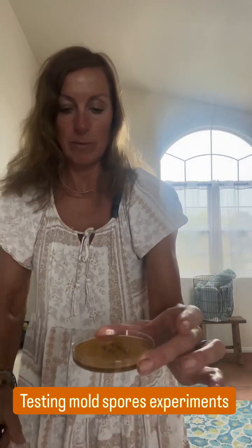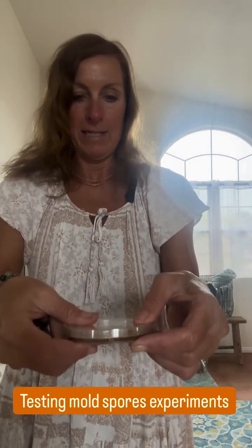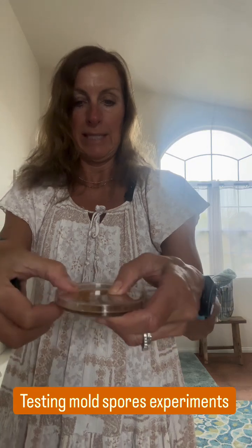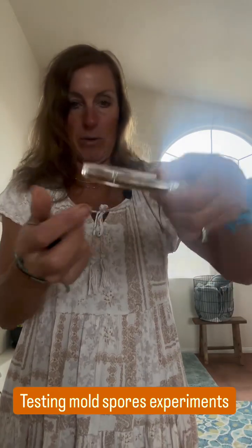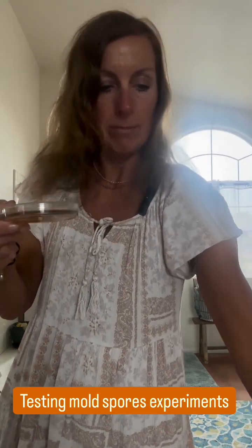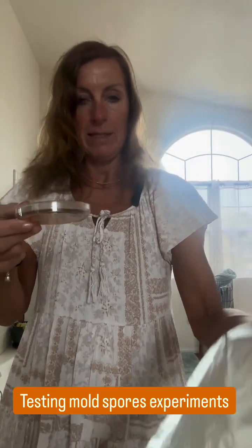I let my petri dish for mold sit out, put the lid on it, and let it set for one hour. Then I taped the corners to seal it up and let it sit in a cool dark area. I wrote on the bottom the name of the room: master bathroom.